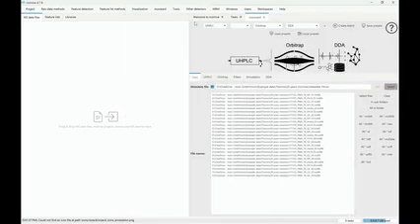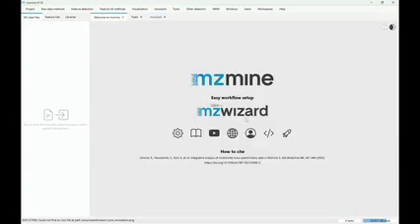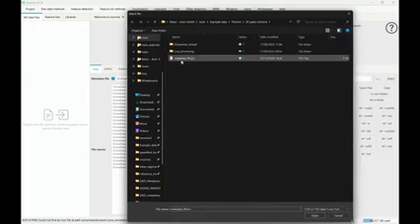If maybe you're searching where I open this, again, the mzwizard is available either from the start screen, there's a button, mzwizard, or you can always find it on top. There's, let me see, wizard, processing wizard. So you can always find it also here on the top, the mzwizard, and open this screen. So again, you change to UHPLC Orbitrap, and then in here, data, we're going to select the metadata file by clicking select and finding this metadata underscore pa.tsv file.